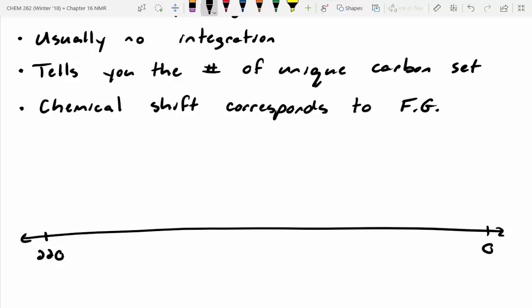And so typically in carbon NMR, students will come up to me and they'll say, what are these peaks around 77 ppm? It normally looks like a triplet like that. This is your solvent peak at 77 ppm. So you can ignore that triplet that shows up. Normally it's pretty small. Just ignore it. That's from chloroform. That's typically our solvent of choice when we're doing carbon-13 NMR. So something to be aware of. All right, there's a bit more too.